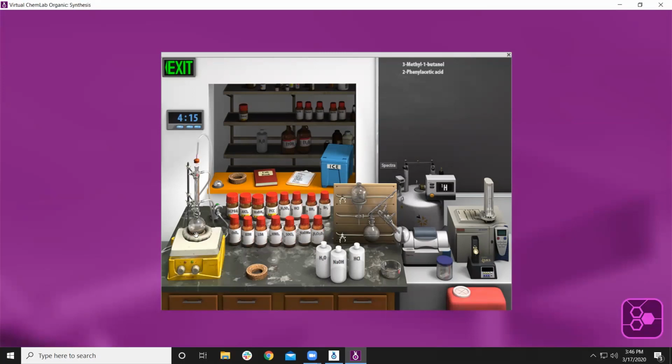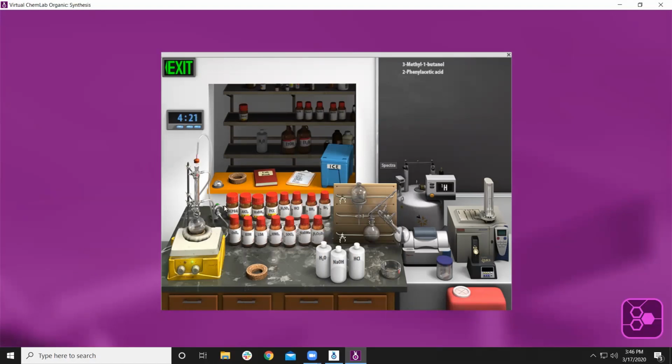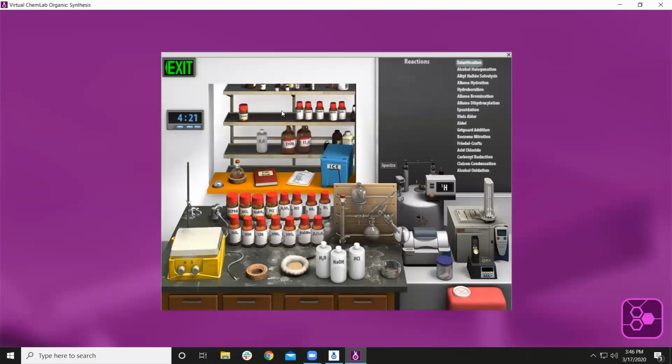We have kinetics running for each of these. So we know the kinetics, first or second order kinetics, and we know how long they take. We know the rate constants. So all that's in the simulation. So if they use ice, then it's going to be really slow, or maybe they have to use ice for certain reactions to slow it down. So same thing, TLC. There it is. Now I'm not going to get products because I forgot my nitrogen, so I'm going to start over again.